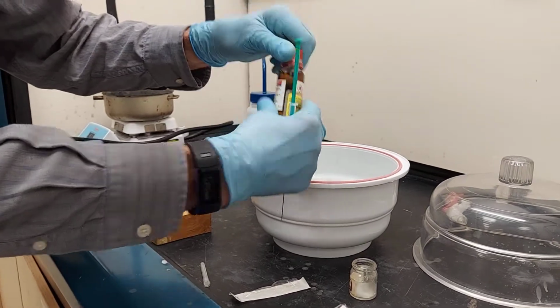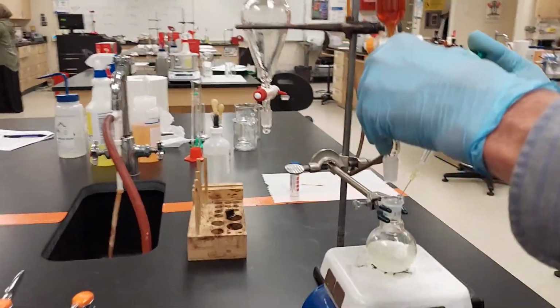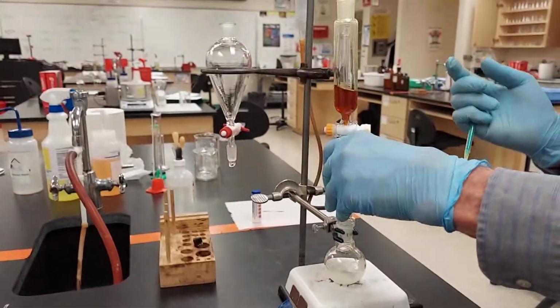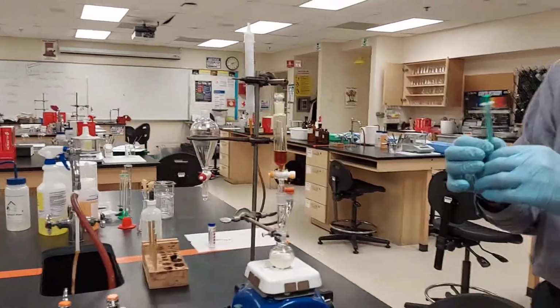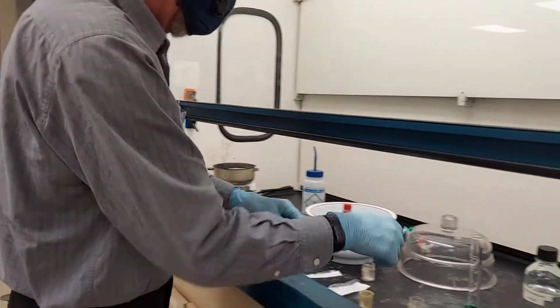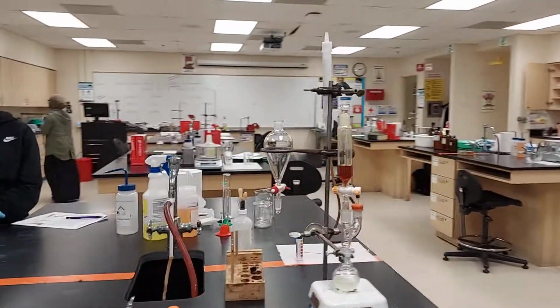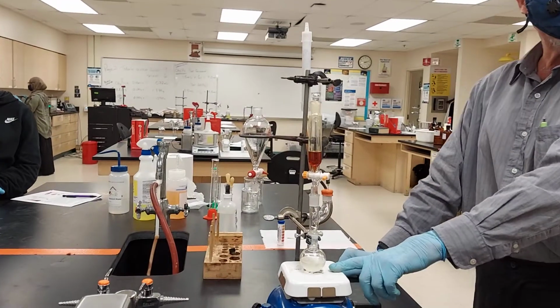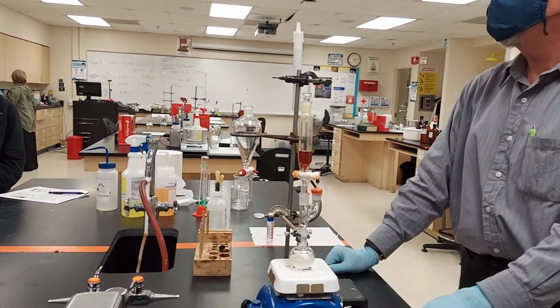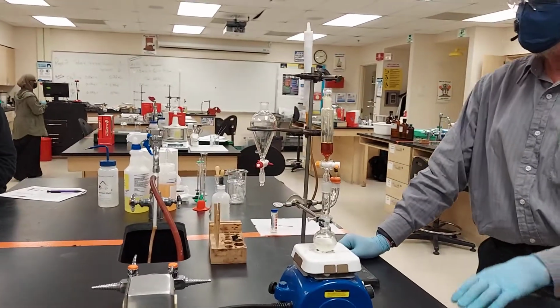And we're going to add that to our aluminum chloride catalyst. It smells a little like vinegar here because the acetyl chloride will react with moisture in the air to create acetic acid, which is vinegar's active ingredient. Okay, good stuff going on. So we have our aluminum chloride in there with acetyl chloride. It's generating today's electrophile called the acylium ion.